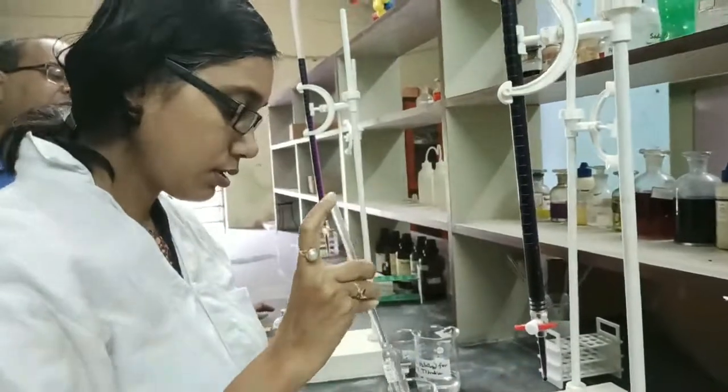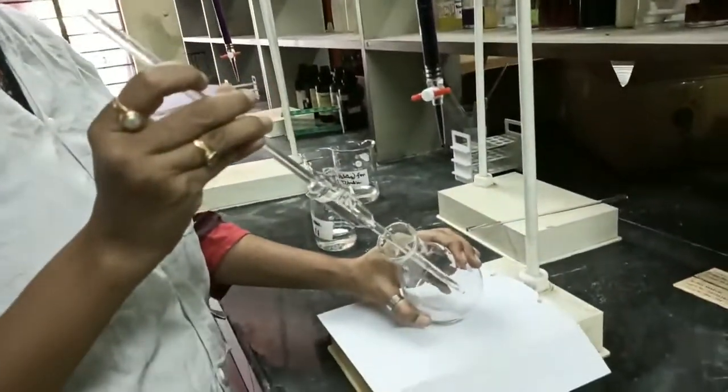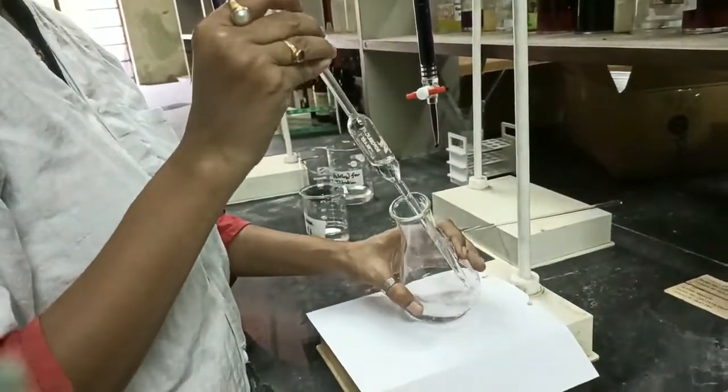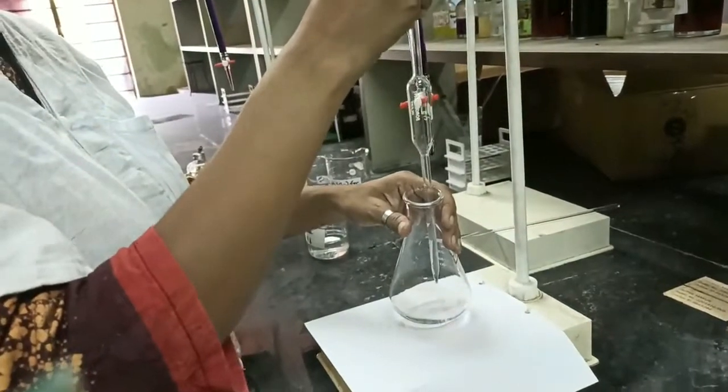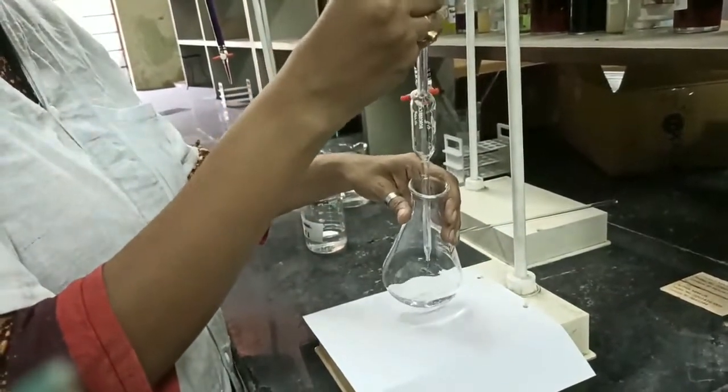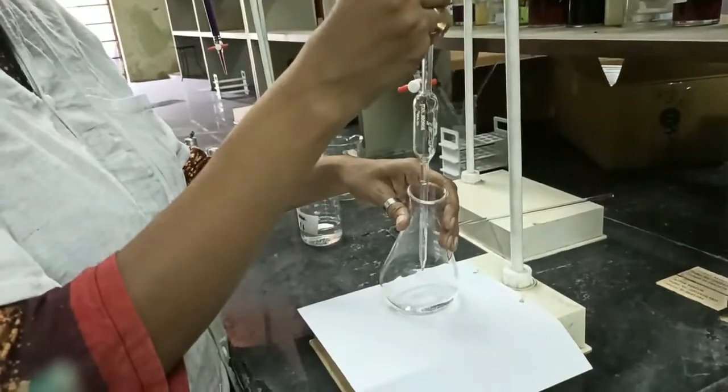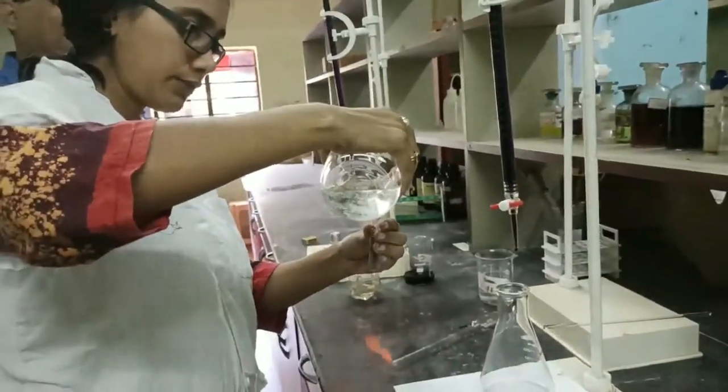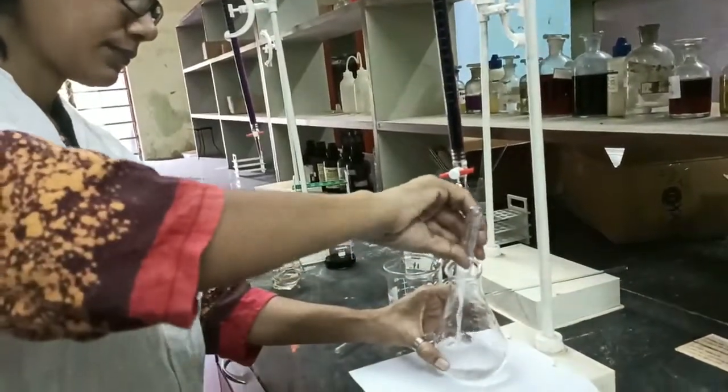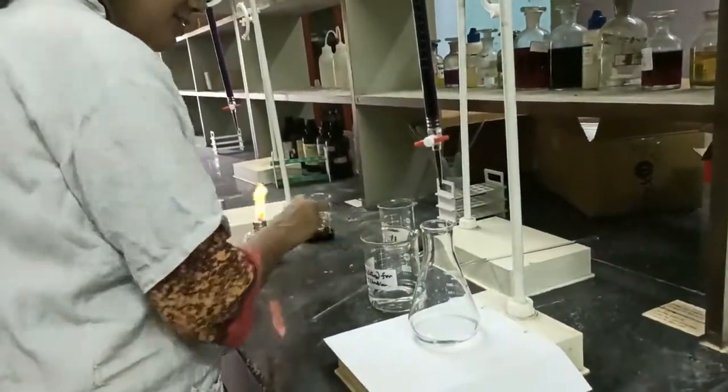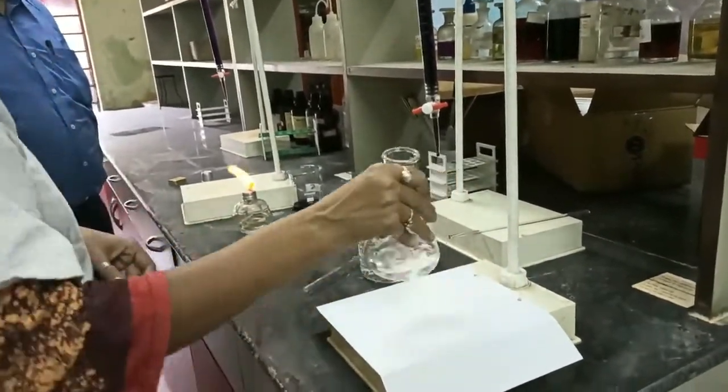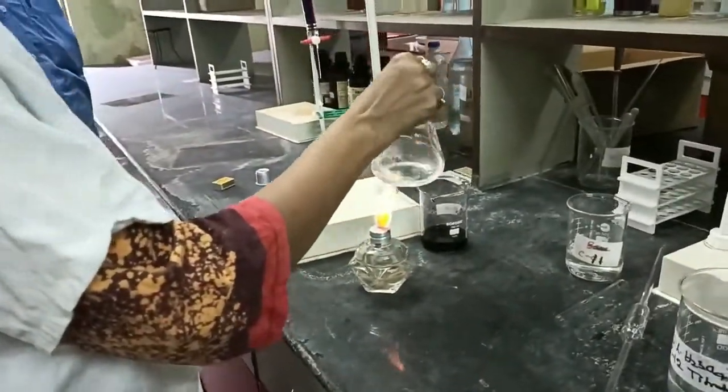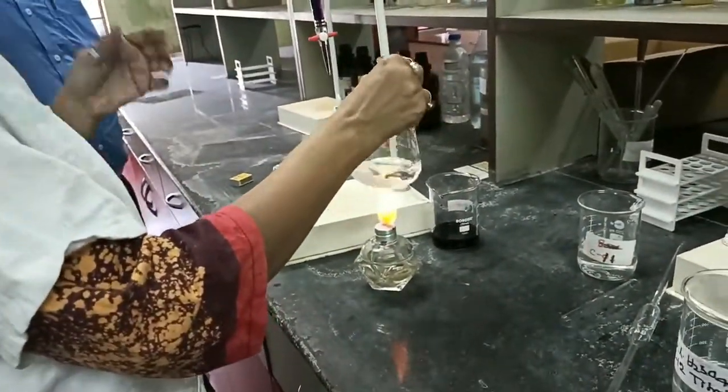The reaction is acid catalyzed. So we are taking one test tube of dilute sulfuric acid and adding it to the oxalic acid solution. Now we need to heat the solution to approximately 60 to 70 degree centigrade. We will be continuing warming the solution till it is unbearable to touch.